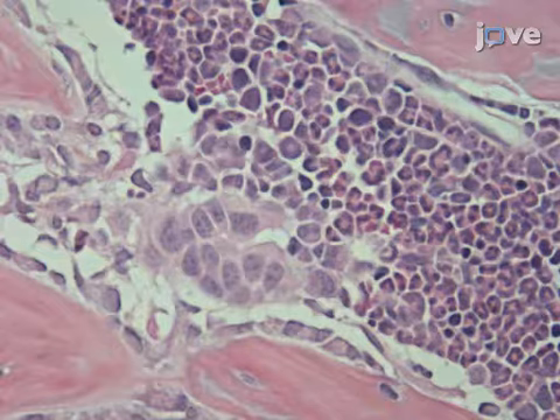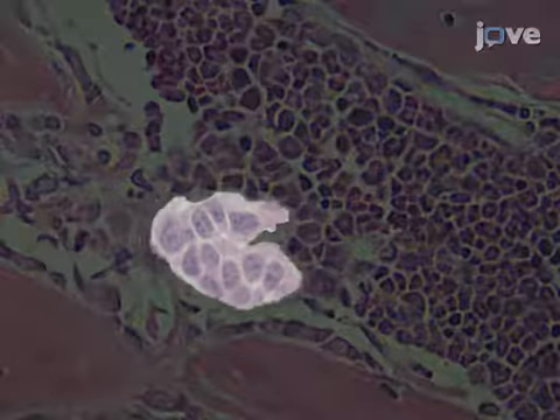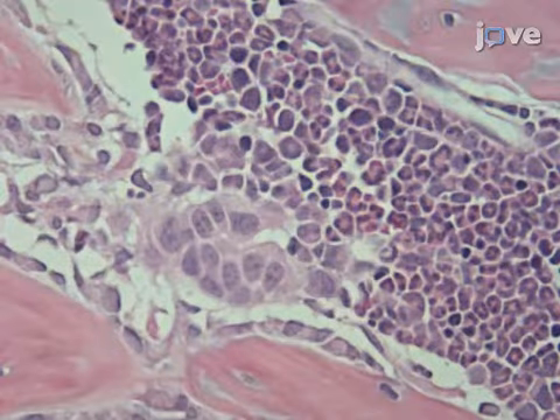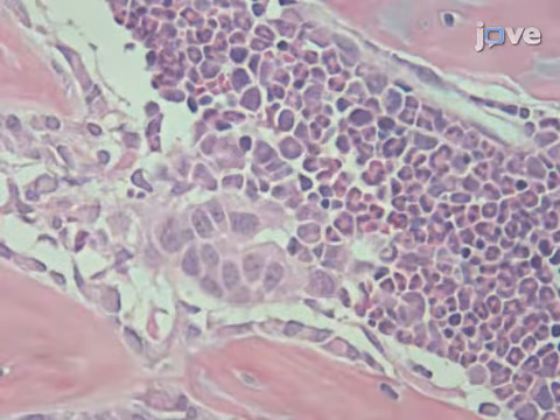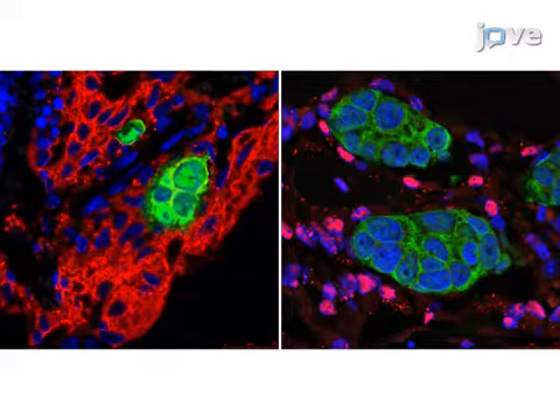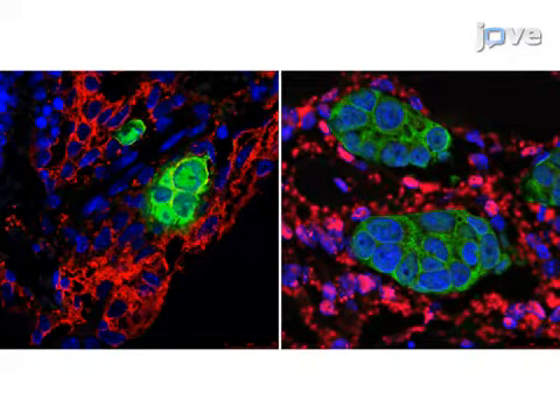Sectioning and H&E staining of the tumor-bearing bones demonstrated a compact, cobblestone-like cell population with large nuclei, indicative of microscopic MCF7 metastatic lesions in the bone tissue 14 days after intra-iliac artery injection. Further, immunofluorescent staining of the bone sections also revealed a co-mingling of the MCF7 cells with osteoblasts and pre-osteoblasts.